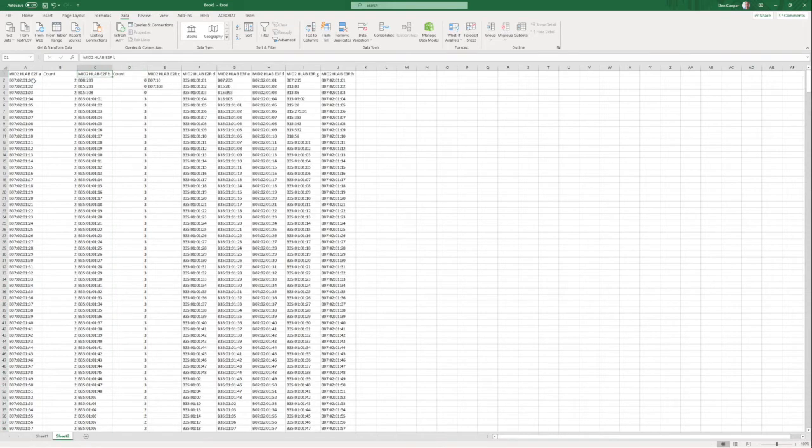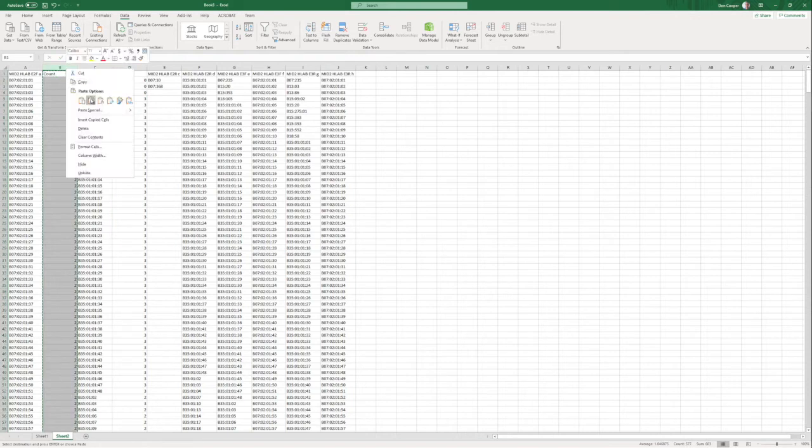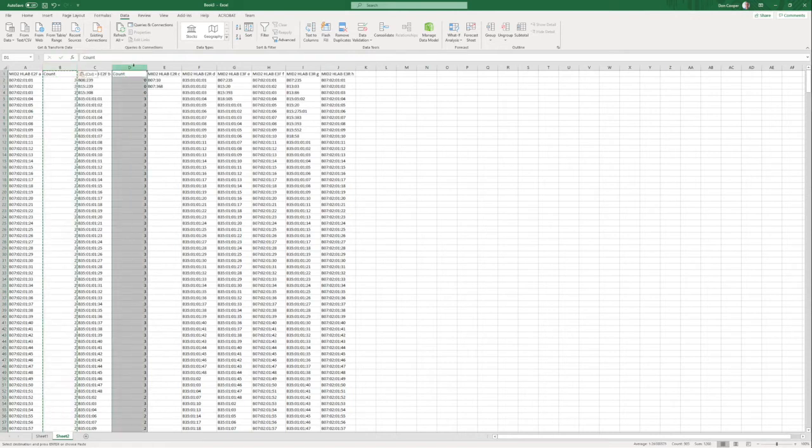Okay, so we can see immediately, just looking at this quickly, that those are probably not the right answer, and yet we've got a whole heap of alleles here which we saw 3 more times, i.e. these are all possible alleles. So we still haven't whittled it down to 1, but we'll do that in the next step. So the next thing that we'll do is copy and paste these formulas as values so that we can sort by it.